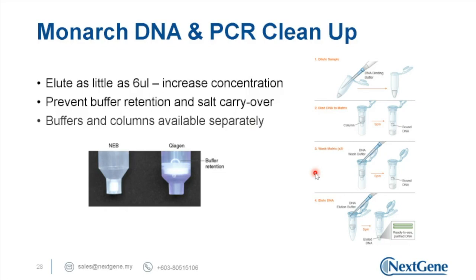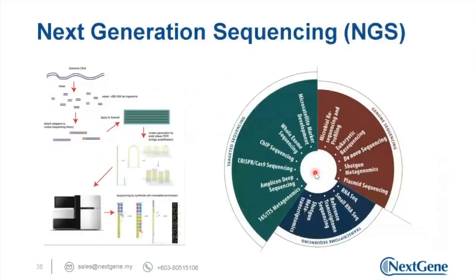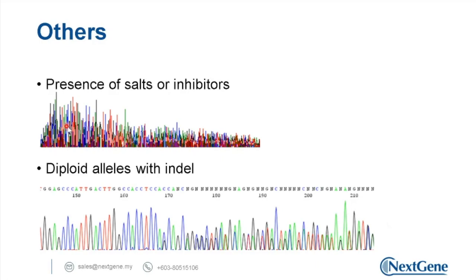What is the reason the sequencing failed completely? Okay. One of the reasons that the sequencing failed completely, meaning that, when we're talking about the reaction failing, a lot of the time we are talking about a cycle sequencing reaction failure. It means that we only see some peaks around 20 or less than 20 over here.